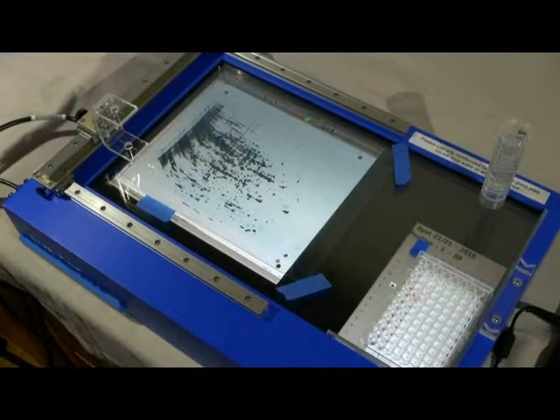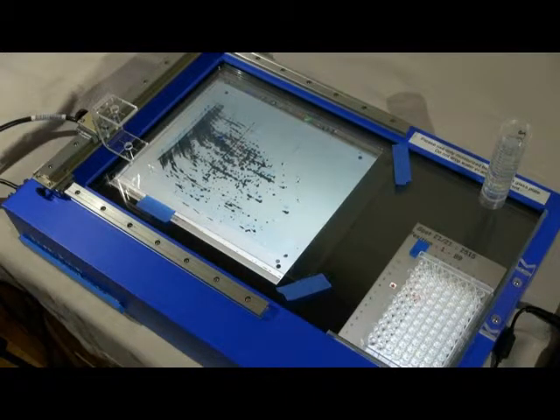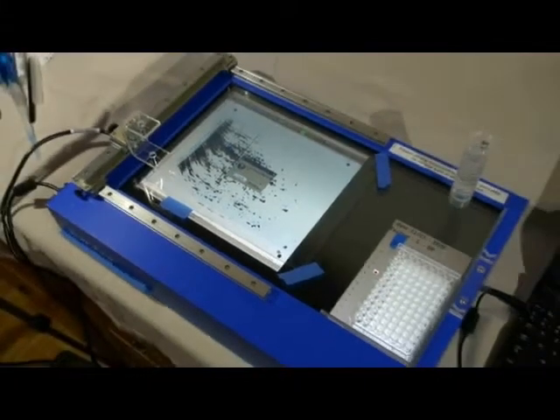if I finish now, I need to save my picking list. As soon as I use one of these two buttons, either to load an additional picking list, or to load another image, let's try with the picking list, I have a message that pops up on the screen and says, save the picking list. Thus, if I click on it, yes, I must enter the name of the picking list to save. And in this case, I will call it video.